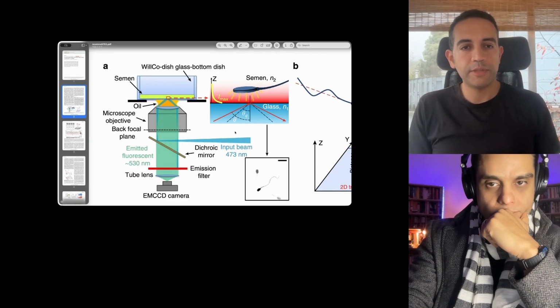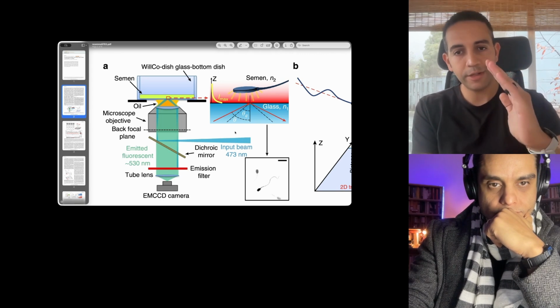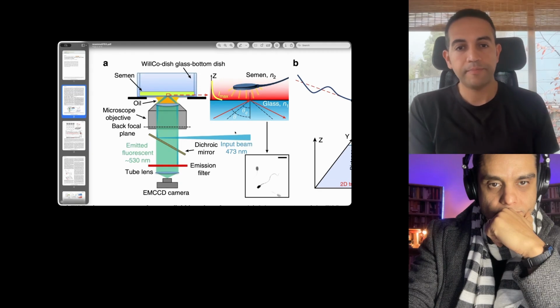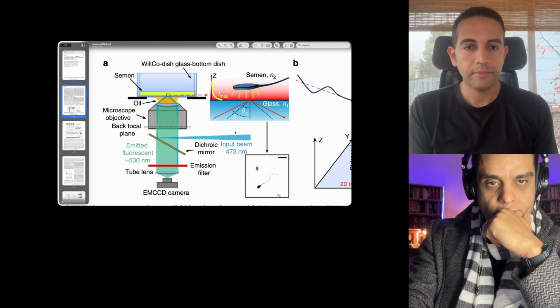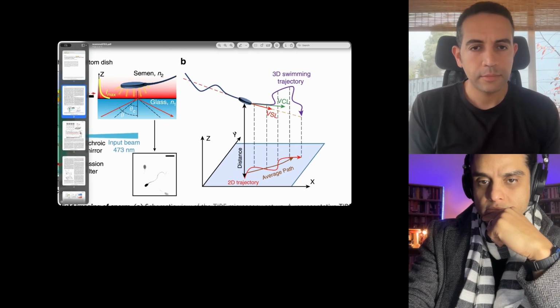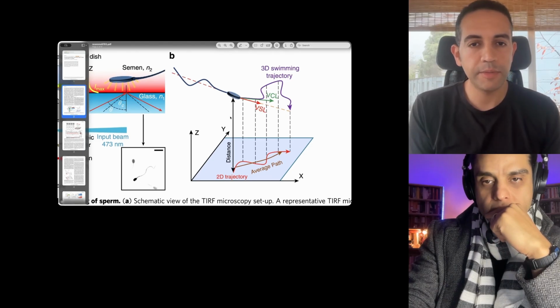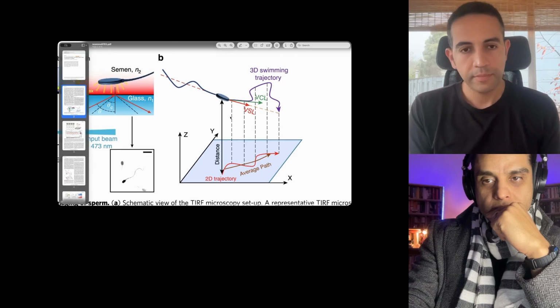In this paper, we just did a few. If I remember correctly, we measured in TIRF and not in TIRF to be able to select. Wow. Okay. But that's all there is to it, without wanting to take away from the beauty and complexity of what Reza did.